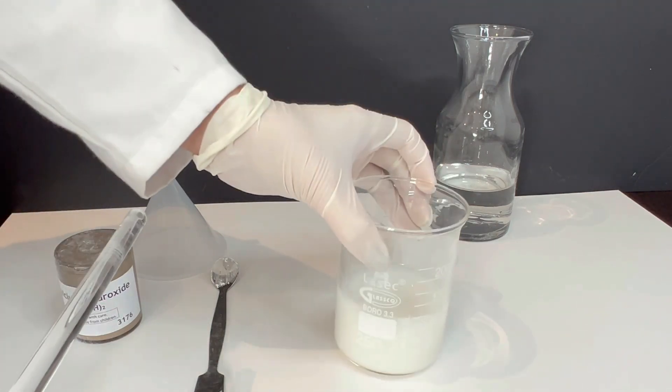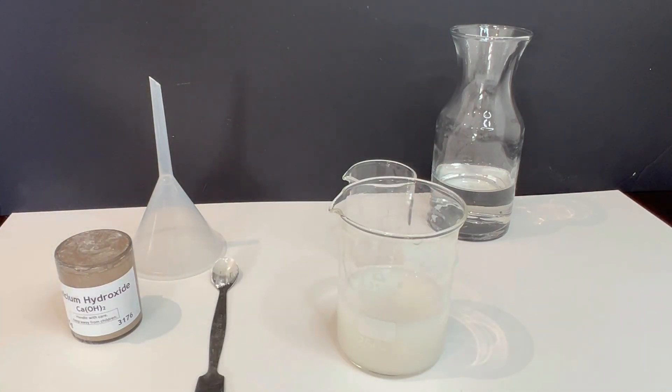Now here's something important to understand. Calcium hydroxide is only slightly soluble in water. This means some of it will dissolve, but the rest will stay as a solid at the bottom of the beaker. What we are creating is a saturated solution where no more solute can dissolve.